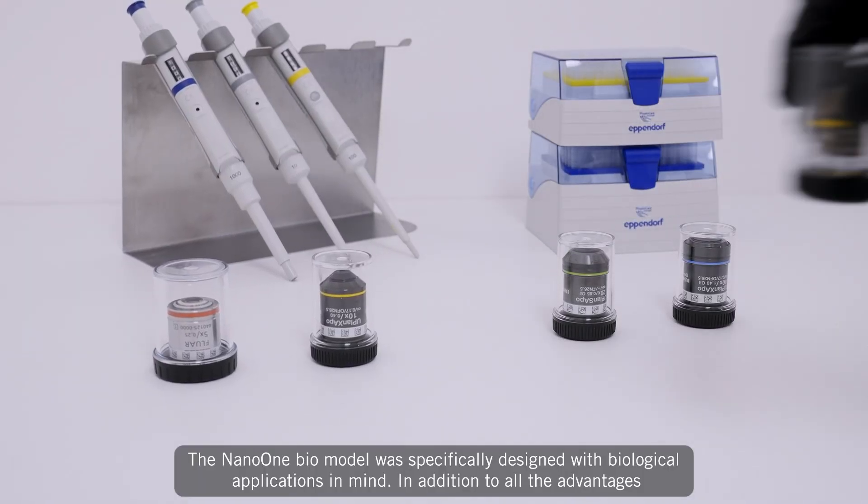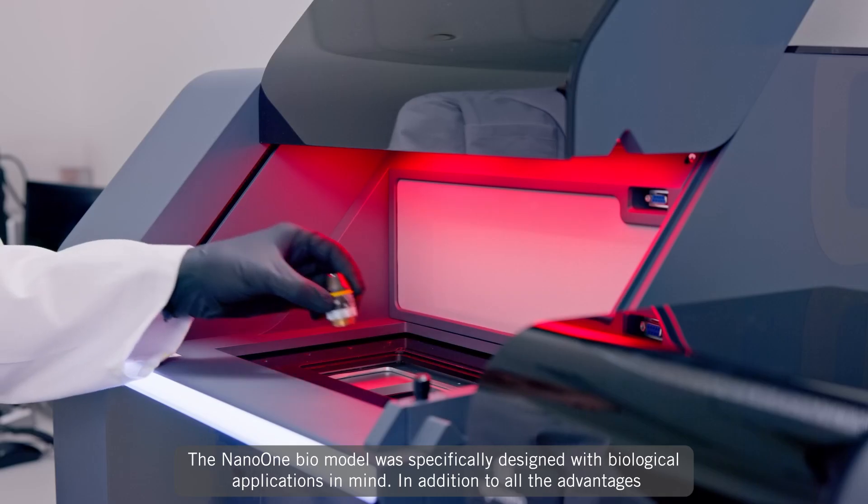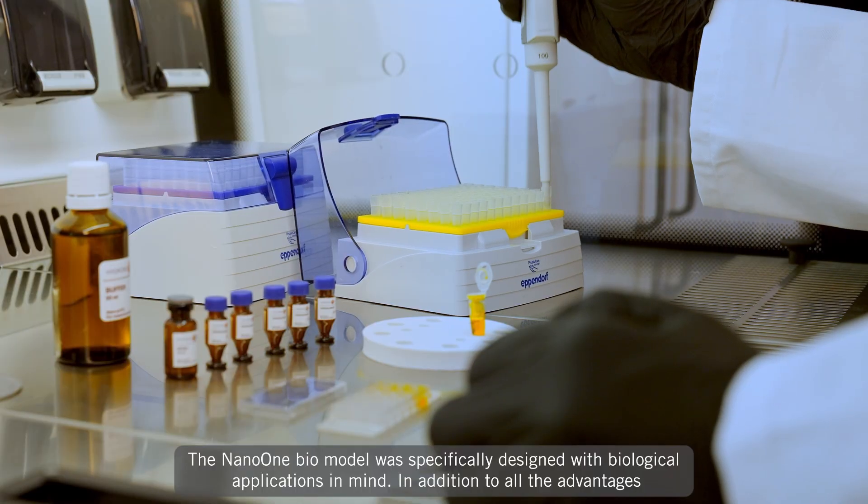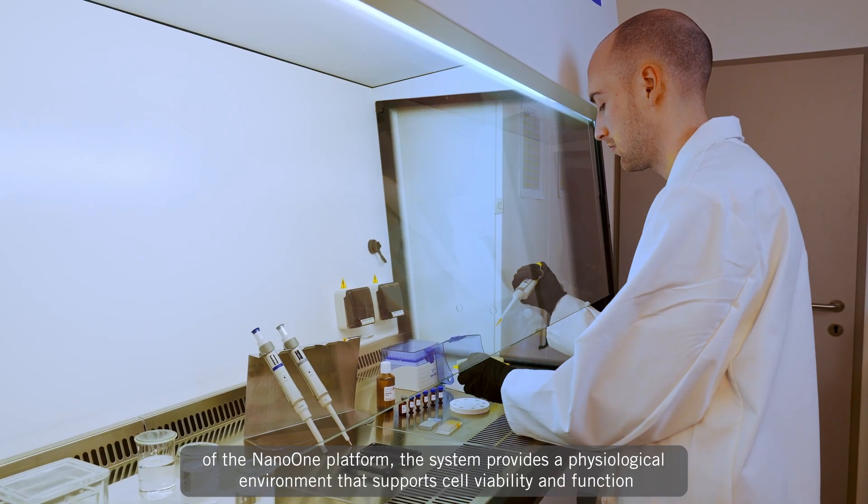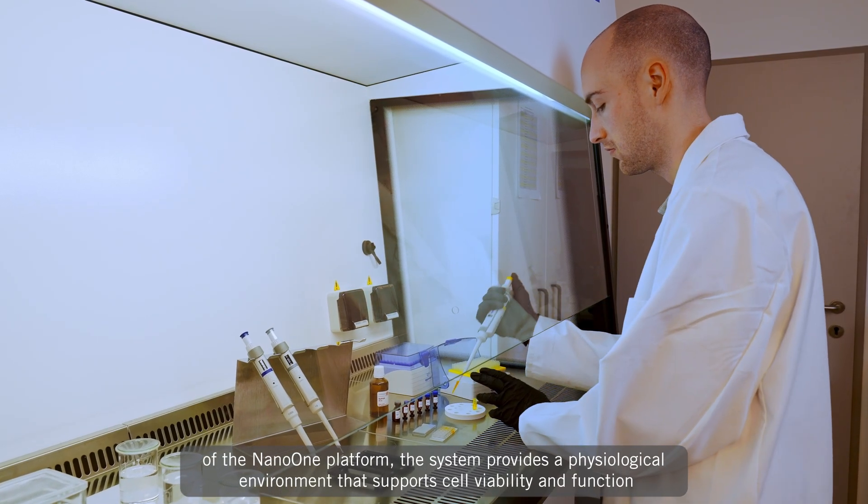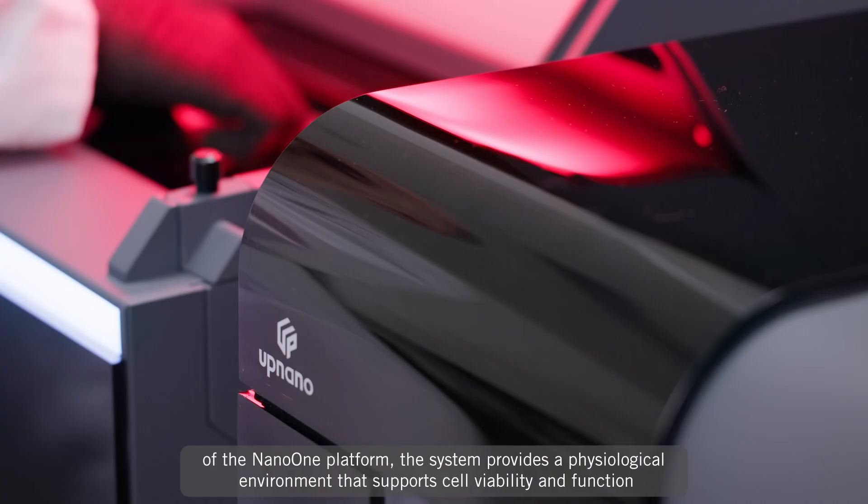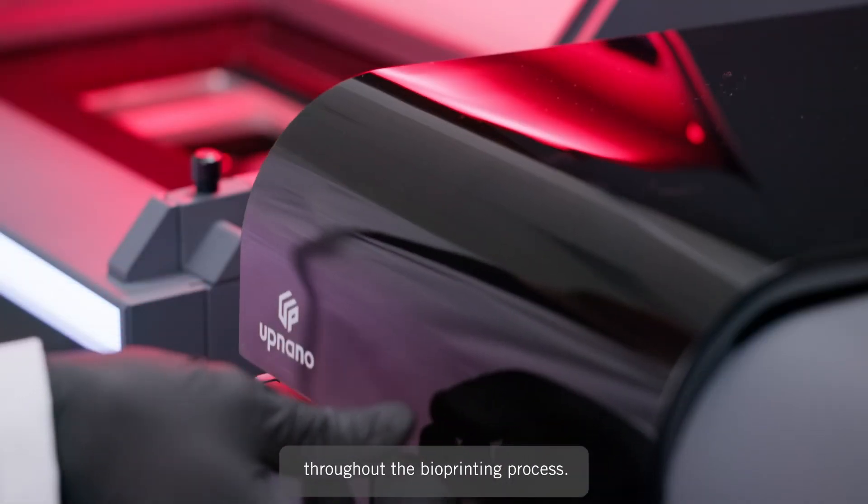The Nano One Bio model was specifically designed with biological applications in mind. In addition to all the advantages of the Nano One platform, the system provides a physiological environment that supports cell viability and function throughout the bioprinting process.